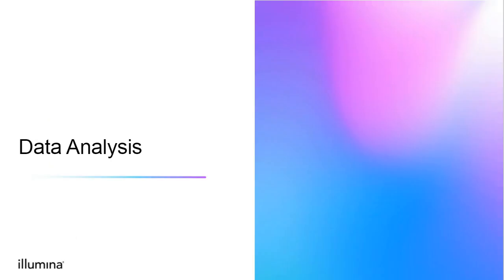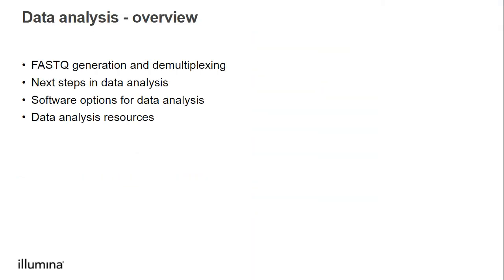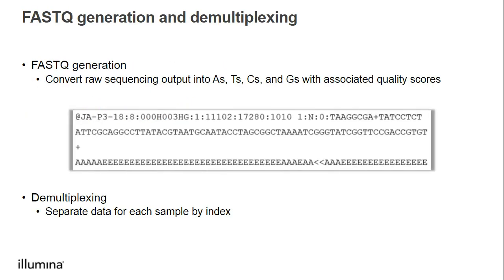Once the sequencing run completes, we can go ahead and move on to data analysis. We will discuss FASTQ generation and demultiplexing, next steps in data analysis, software options for data analysis, and data analysis resources. Our first steps are FASTQ generation and demultiplexing.